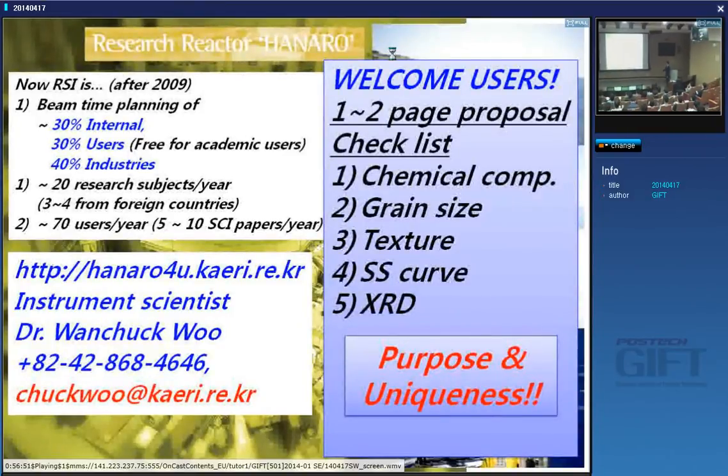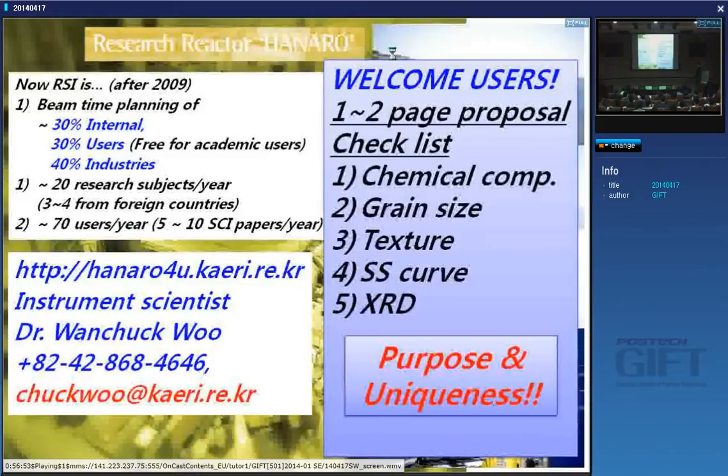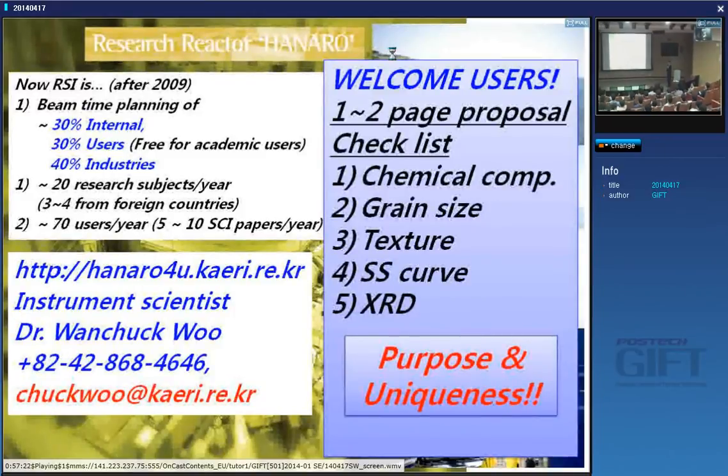If we have good ideas, I'm in charge of the stress machine, but if we want to measure some particles or precipitates, I can pass your proposal to the small angle scattering people, okay? Or if we want to know the exact composition from the powder, I can talk to the powder diffractometer people, and you can collaborate with other guys, okay?